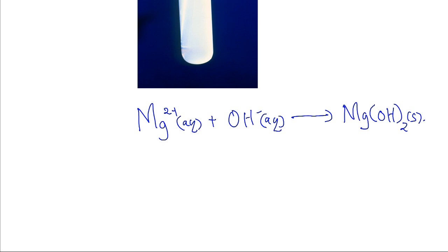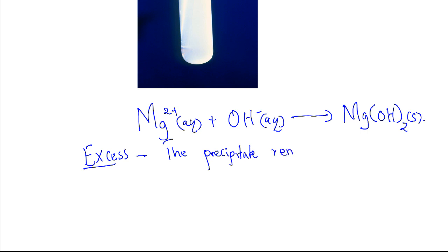In excess of sodium hydroxide, the precipitate remains insoluble.